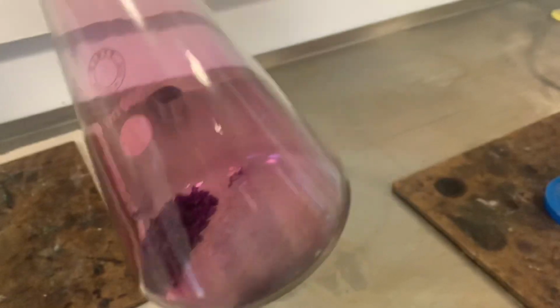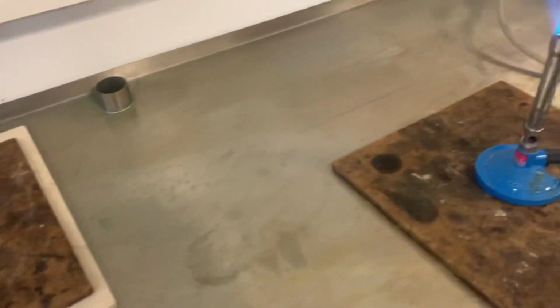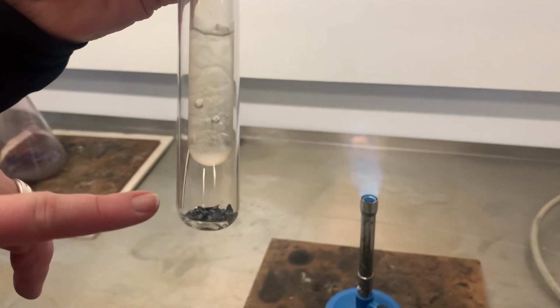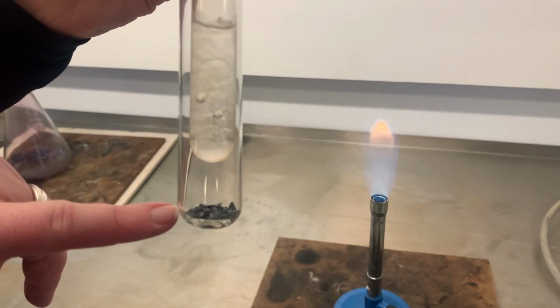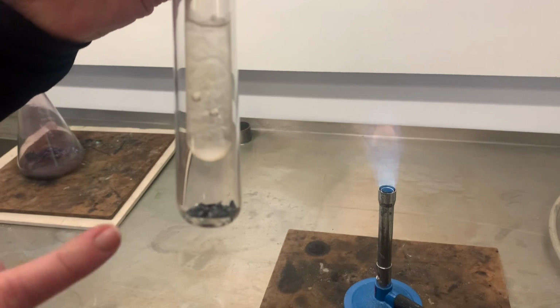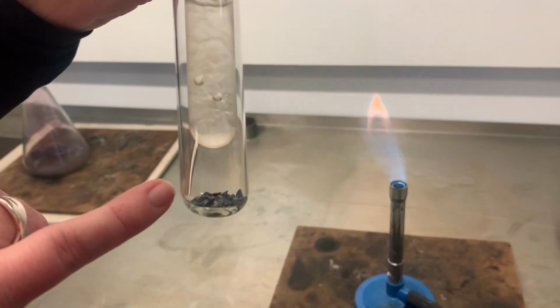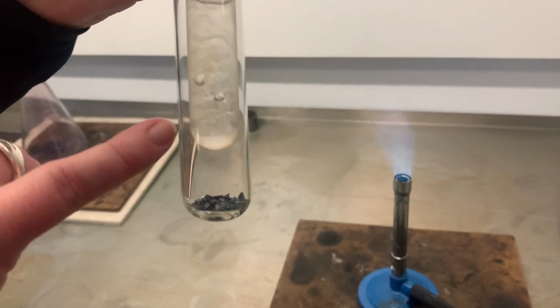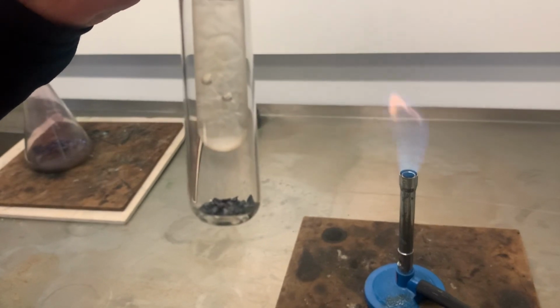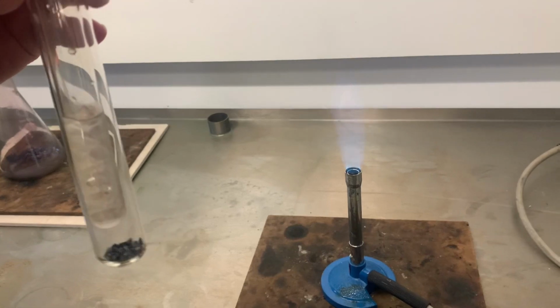Now, there's a much easier way or better way of showing you the sublimation again using the test tube and the boiling tube. I'll do that now. So we've got a boiling tube with some iodine crystals, the grey solid at the bottom, and inside it we've got a test tube that has some ice in it. We're going to gently heat the iodine. It's going to sublime and turn into the purple vapour, which will then hit the cold surface of the test tube and sublime again and form a grey solid. We should get some lovely grey crystals forming on the surface of that test tube. So let's see if it works.